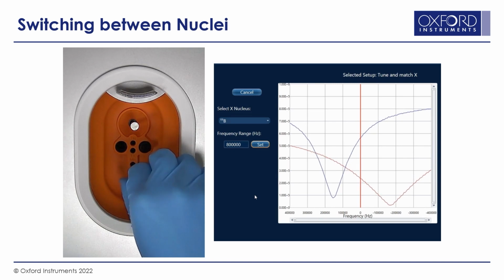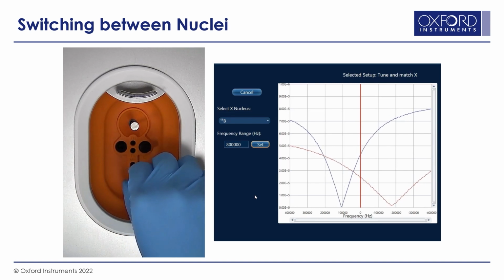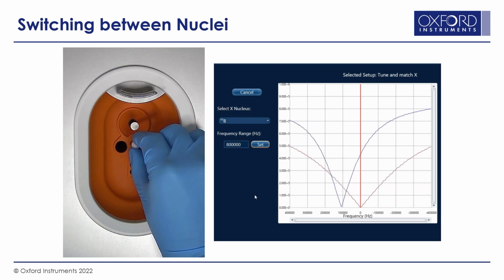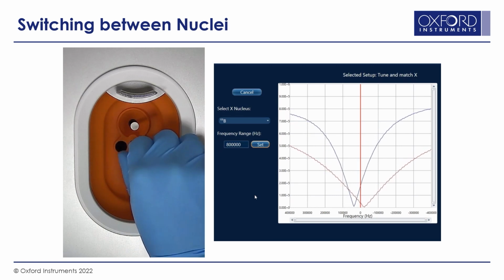A particular example might be that when collecting simple proton NMR, the optimal tuning position will be different when you're looking at a simple small molecule organic, perhaps in chloroform or similar, and when you might be looking at a highly polar system, such as something with high salt concentration like a battery electrolyte, or indeed an ionic liquid. And systems with a fixed tuning can never give equally good performance for both those classes of sample.